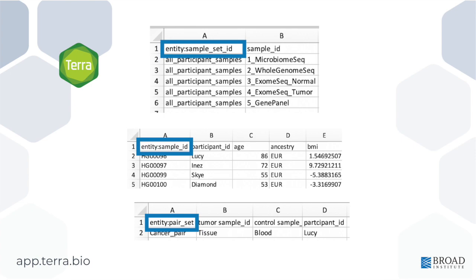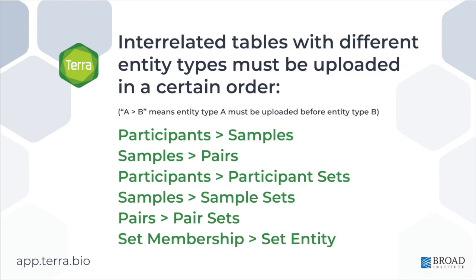Number three, if the study you are running requires the use of multiple entity types. For instance, if one table is keeping track of the list of patients and another is keeping track of various samples from those patients, you will need to upload those tables in a specific order and click Create Participant Sample Pair Associations at the prompt in the pop-up window that appears when you try to upload the files.